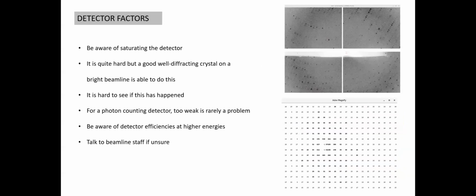I can skip quickly over this because it was mentioned by Graham. You can also actually saturate these detectors. It's really hard to see. So you really need to analyze the pixel counts in the image viewer software.